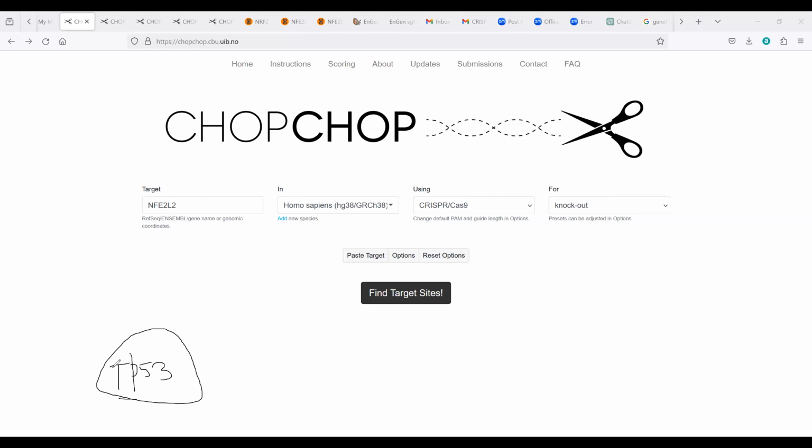So the thing is, what about supplementing this gene? What if we can knock in an extra copy of this gene in case the gene is inactivated? We can always take any gene and do a knock-in. But where can we do knock-in? Because you have chromosomes, right? And in which chromosome will you do knock-in? And by knocking in, whether any existing gene will not get perturbed. So these are very important questions, right?